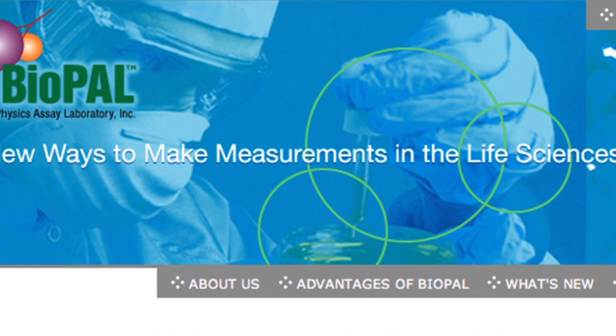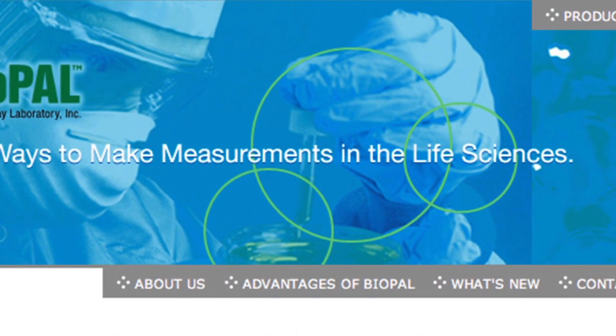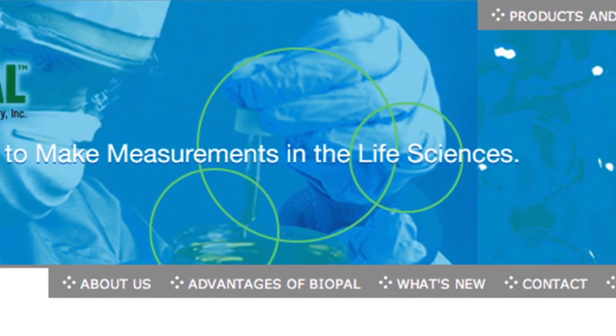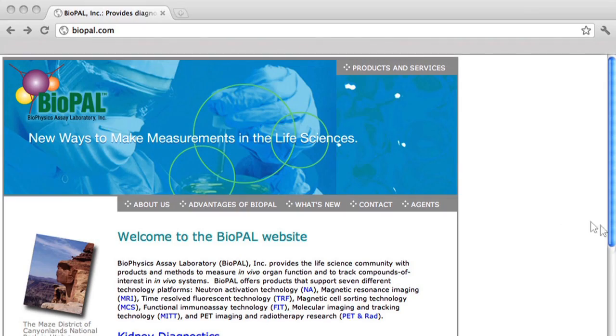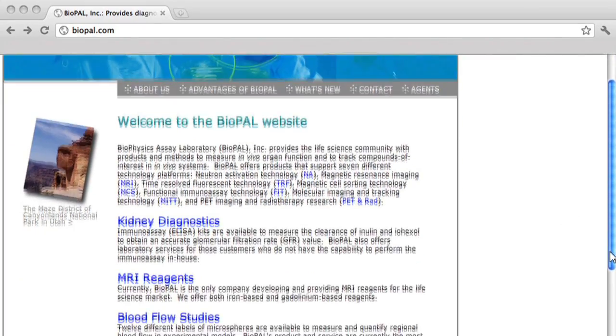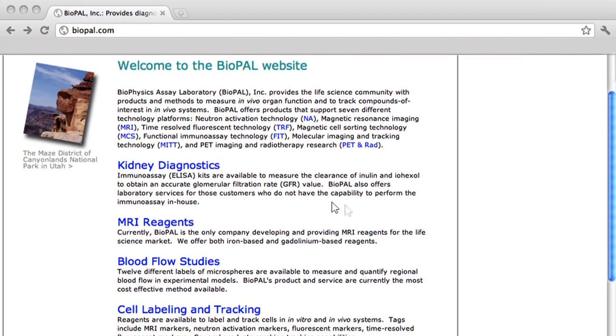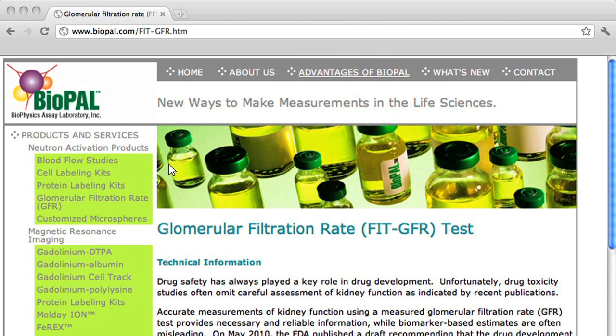For your convenience, Biopal provides a kit worksheet and checklist for both the inulin and iohexol FIT GFR kits, which are available as PDFs on our website. Simply open your browser, click the toolbar and type in biopal.com, then hit enter. This will bring you to Biopal's homepage. From here, scroll down and click Kidney Diagnostics.